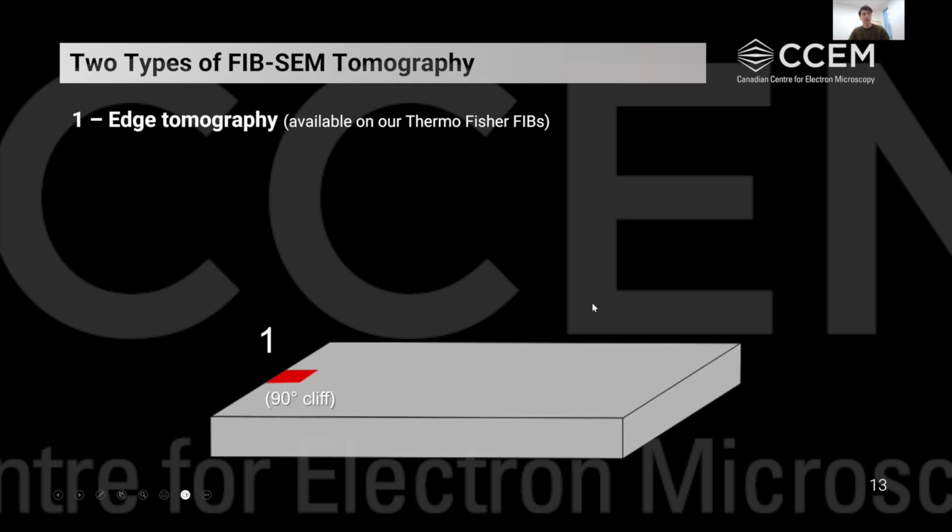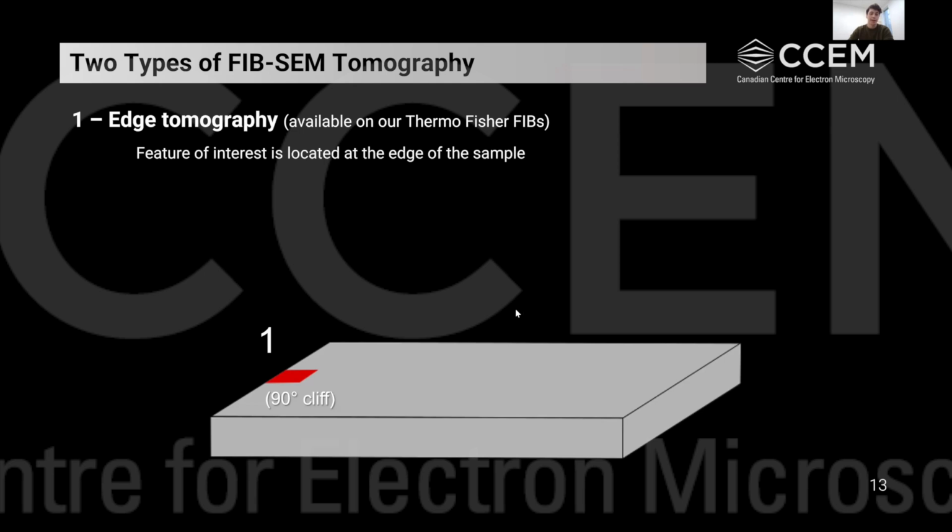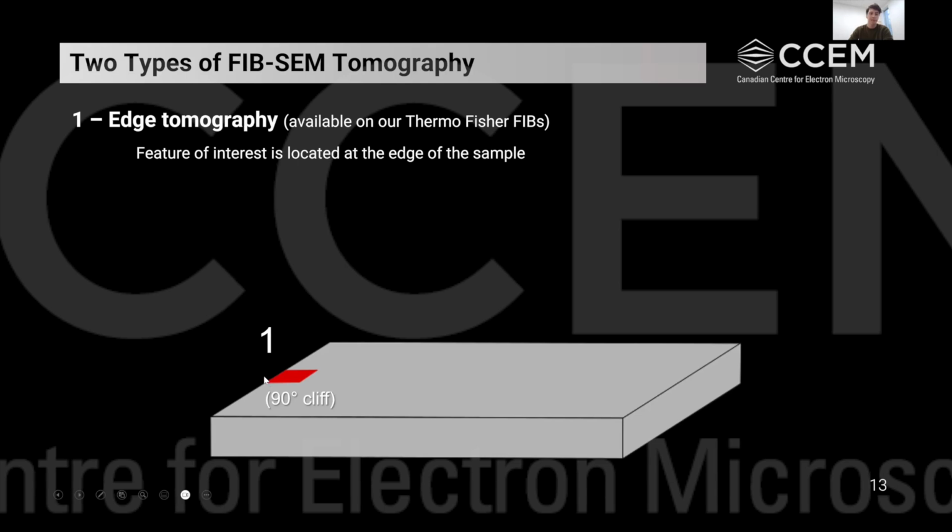And so for FIB-SEM tomography, there's 2 types of specific tomography. There's edge tomography, which is available on our Thermo Fisher FIB systems. And for that, we need a feature of interest that is located on the very edge of our sample. So we need a 90-degree cliff face here.